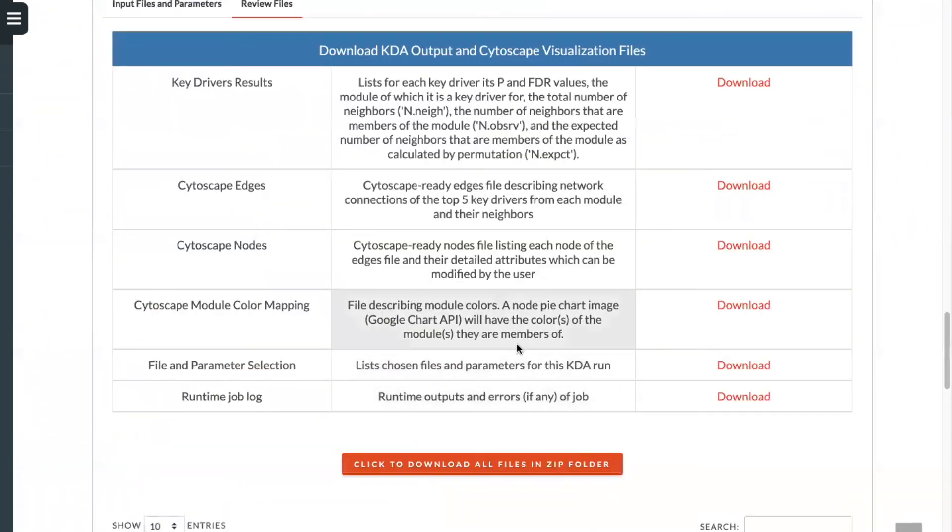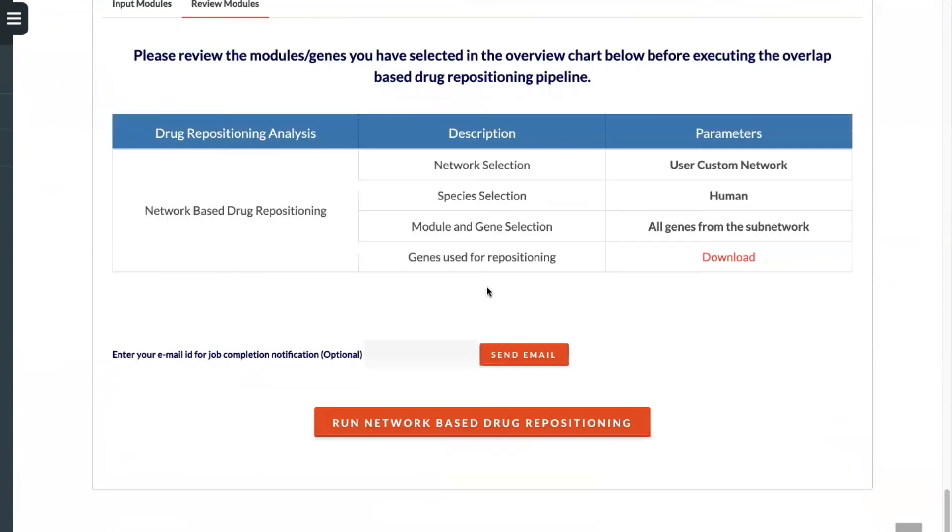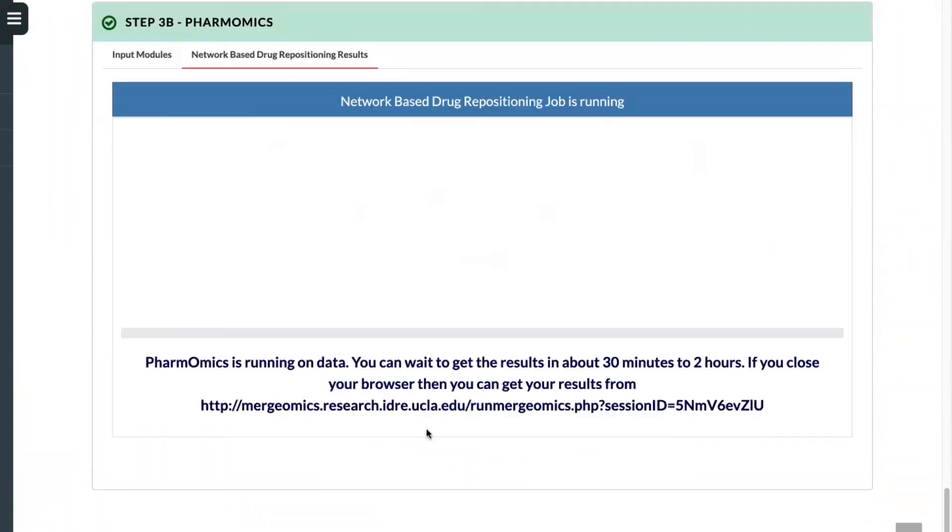You'll be able to click to review, which will show the custom network's been selected, the species, the module and gene selection, and again, you'll be able to input your email address. We can now run the analysis.